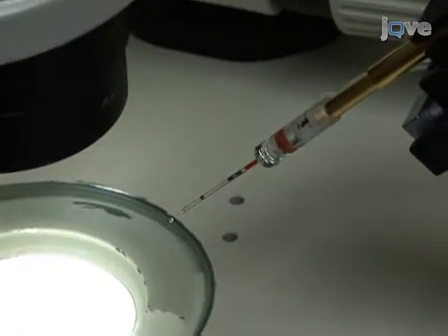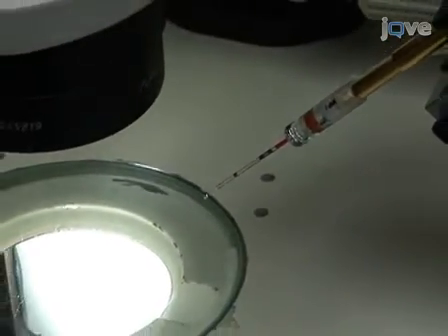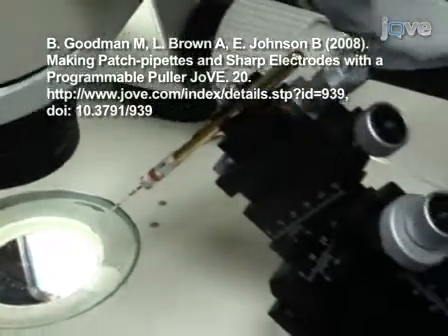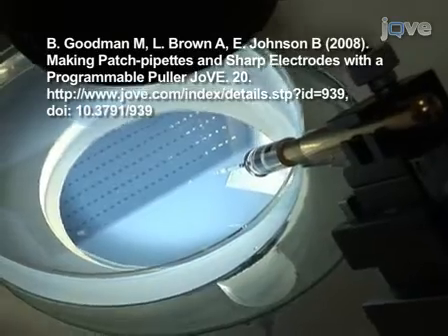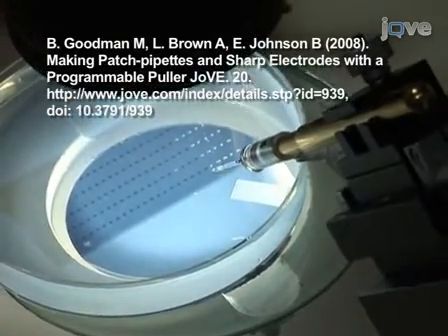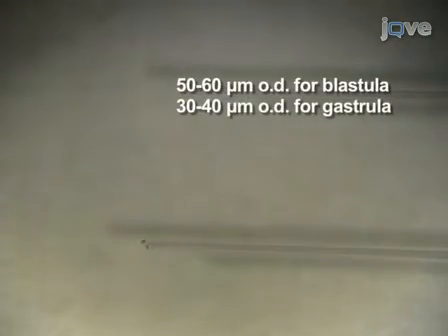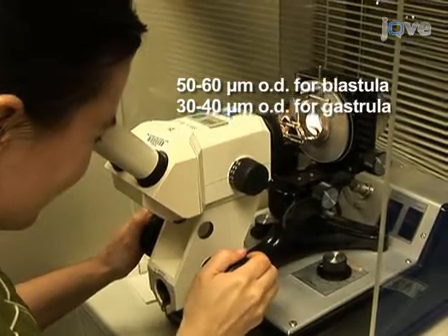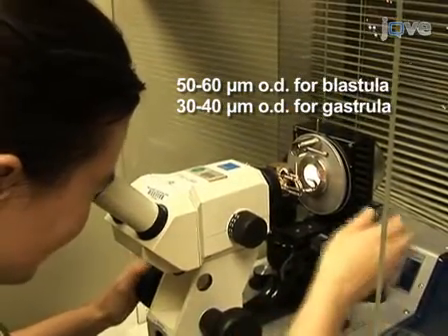Transplantation needles are made from glass capillary pipettes that are drawn to a gentle taper on an electrode puller. See the Jove protocol from the lab of Miriam Goodman for details on pulling pipettes. Under a dissecting microscope, break the tip of the pulled needle off. For blastula stage transplants, the outer diameter of the needle should measure approximately 50 to 60 microns, or 30 to 40 microns for a gastrula stage transfer.